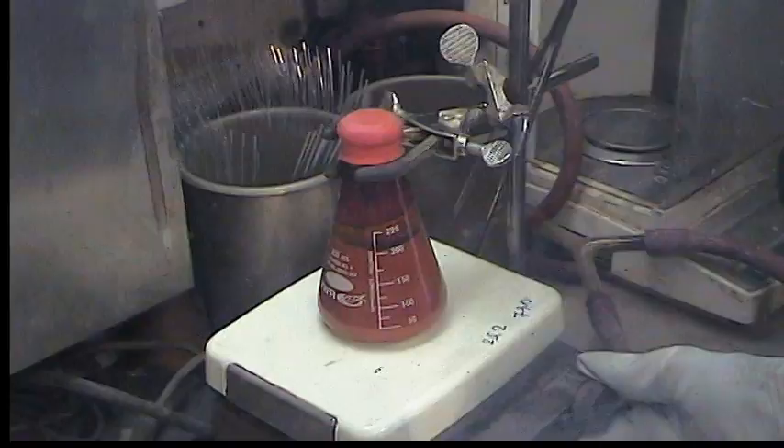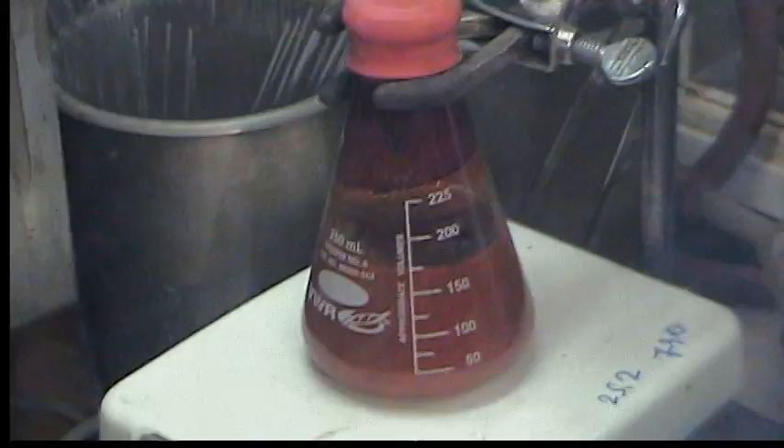It's an orange powder and we're just going to let it settle. It's been stirring overnight.